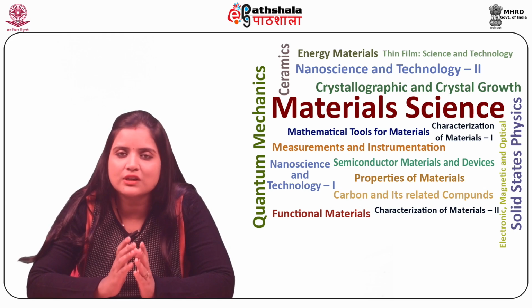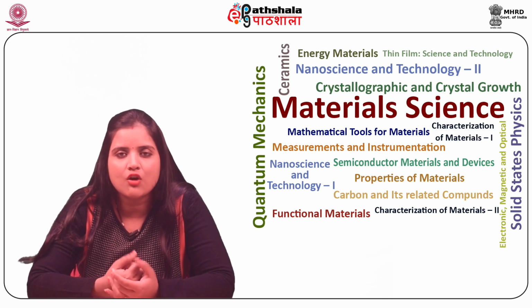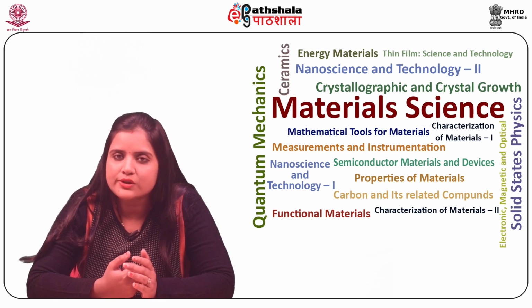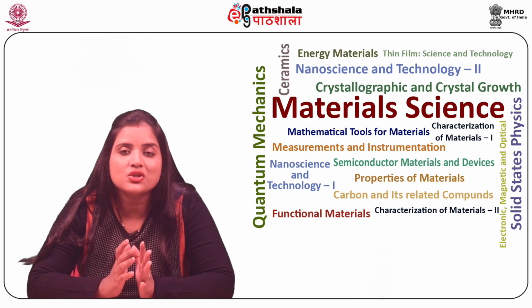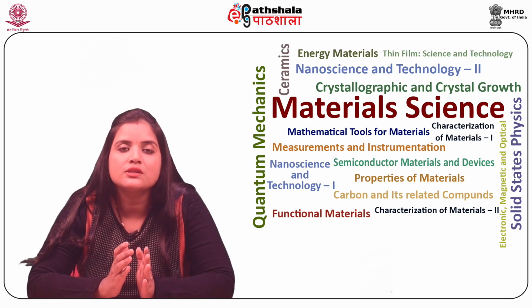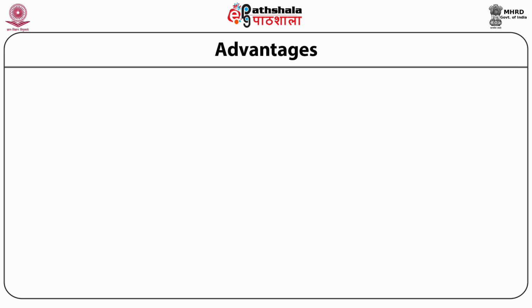For a particular physical device, for example an SLM, realization of driving signals to obtain the optimum approximation of the desired time-varying three-dimensional light field is a difficult reverse problem. Let us discuss the advantages of holography.